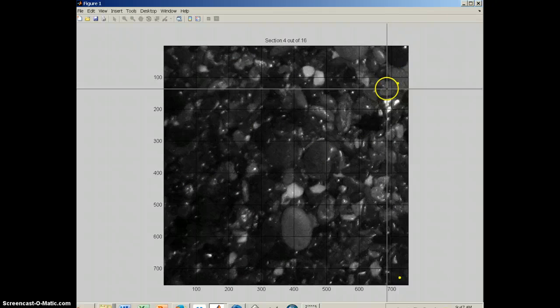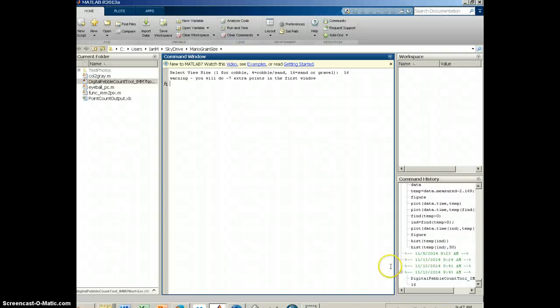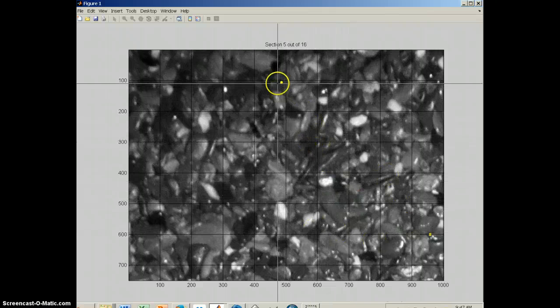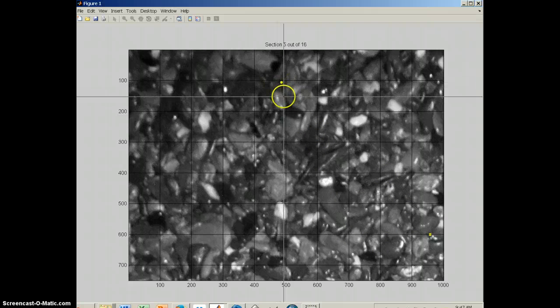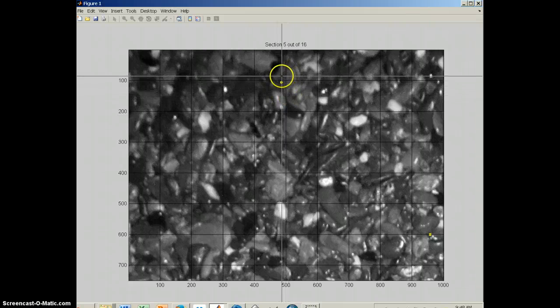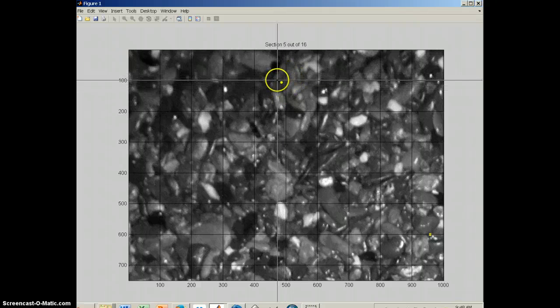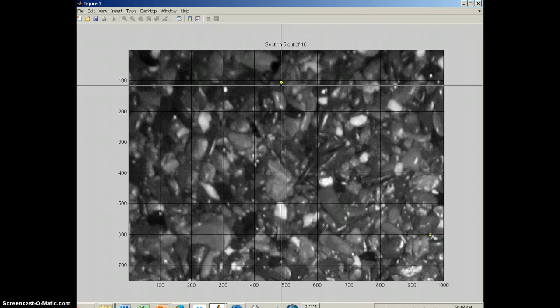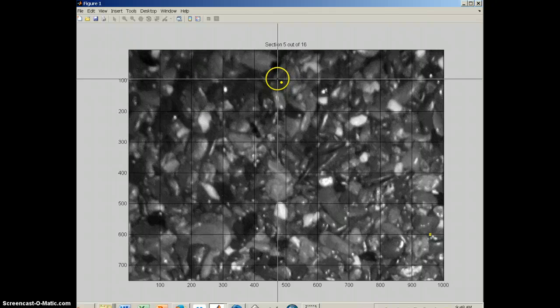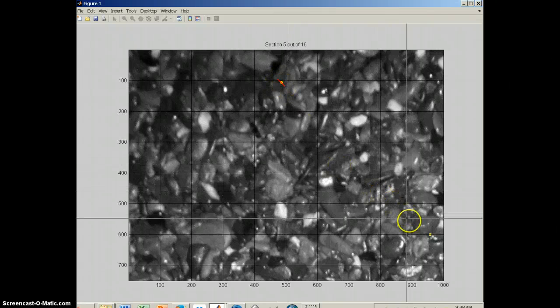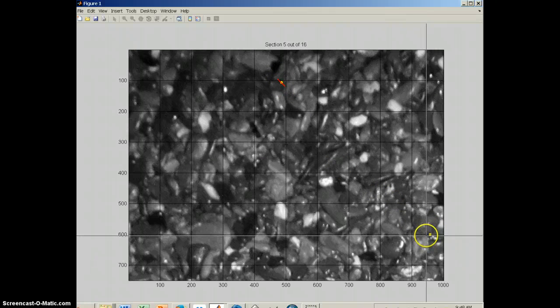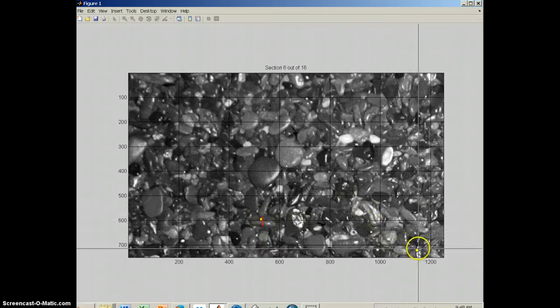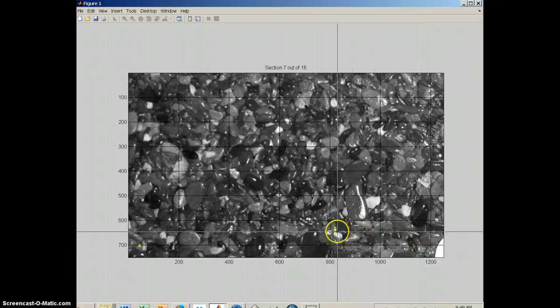There's a little bit of guidance on what you're looking for. Basically, you want to try to measure the intermediate axis of the grain. These are a little bit hard to see, but this one, for example, is cylindrical in shape. So it has a short axis that would be the axis going into the screen, a long axis, which is this one, and then the intermediate axis, which is that one. Some of the grains are sort of roundish, and there it doesn't really matter for our purposes. But in general, you want to try to get what's called the intermediate axis of the grain.